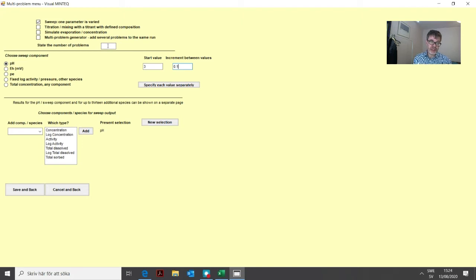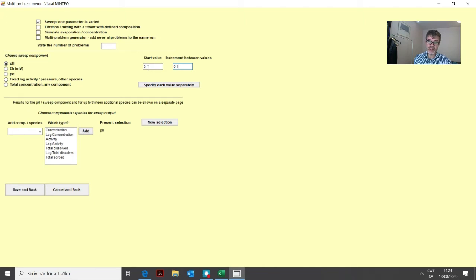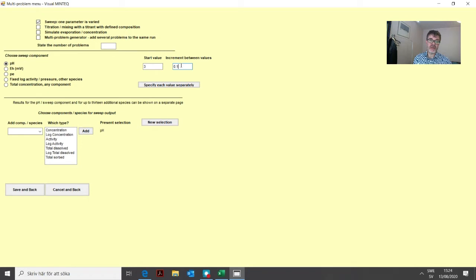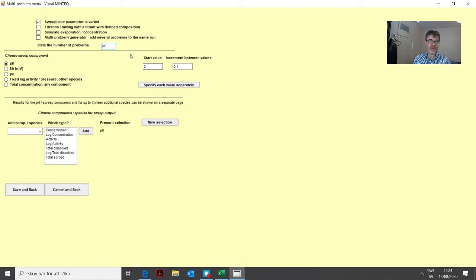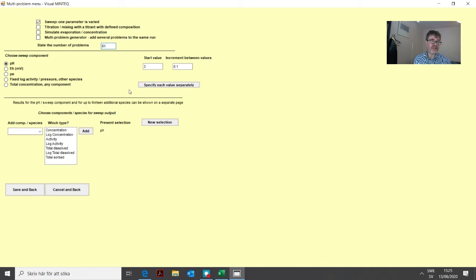Then we need to state the number of problems. We start at pH 3, the next point will be 3.1, 3.2, 3.3 and so on. Let's assume we go to pH 9. From 3 to 9, it will be 61 problems actually. So that is the number of data points in the sweep that we add. This first part of the menu is done.